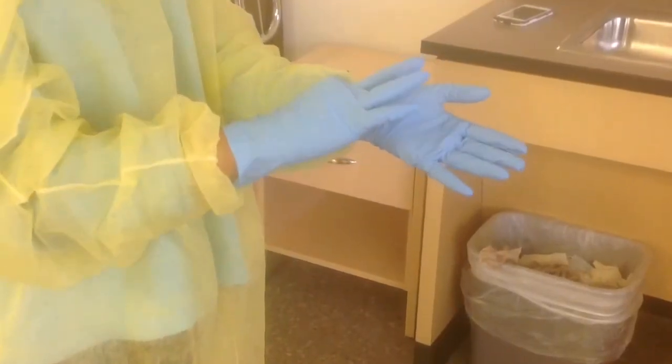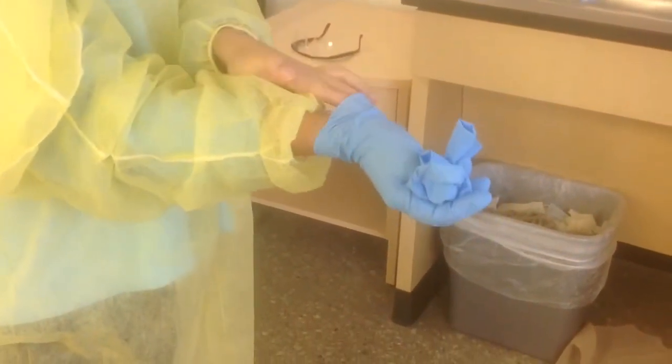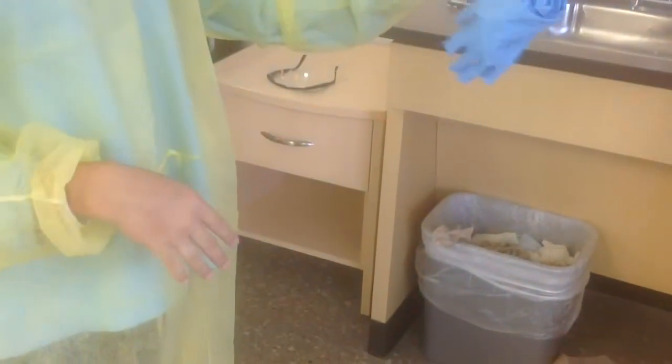The second way is to pinch the cuff of your glove and pull it over your hand. Crumple it. Take two fingers, put them skin to skin under the second glove and pull it over your hand. Then dispose of it.